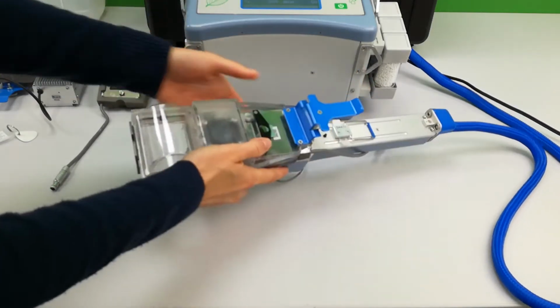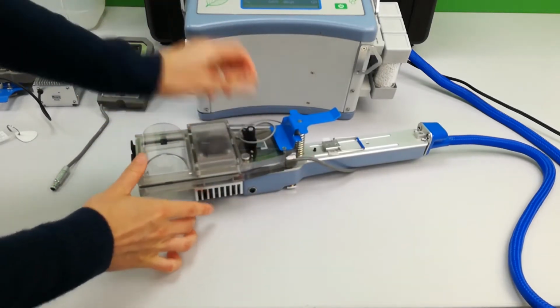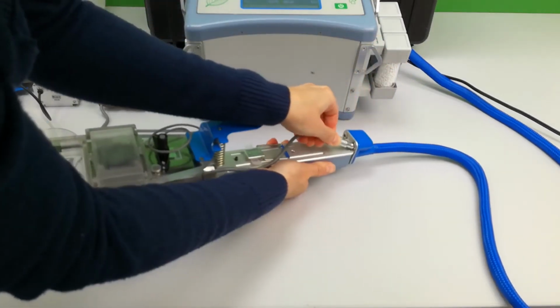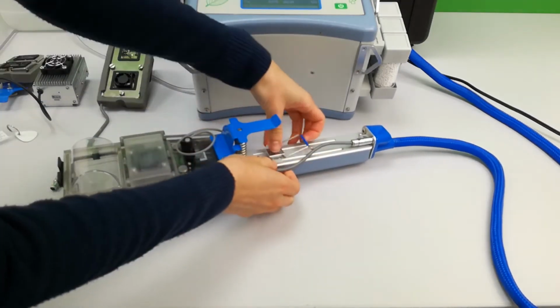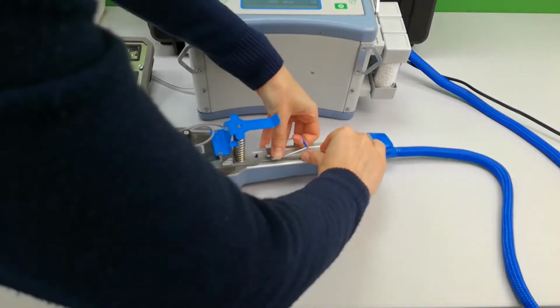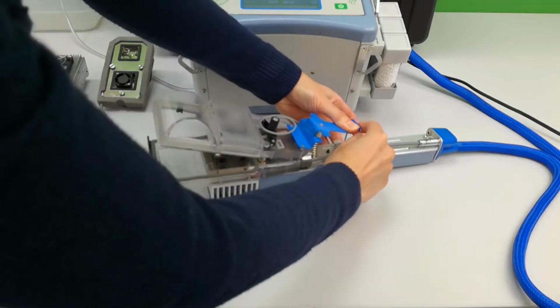Fit the PAR sensor in place and then line up the 2 red dots on the cable connector which attaches the lower jaw to the handle. Use the clip to secure in place neatly along the groove of the handle. Release the clip at the front of the jaws in order to latch the jaws open for storage.